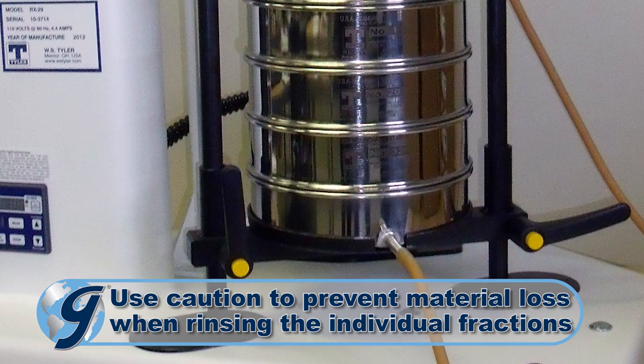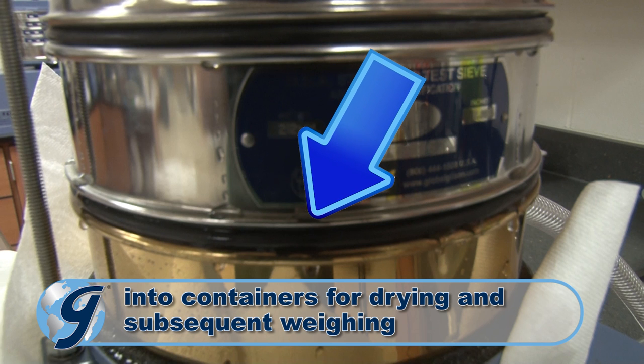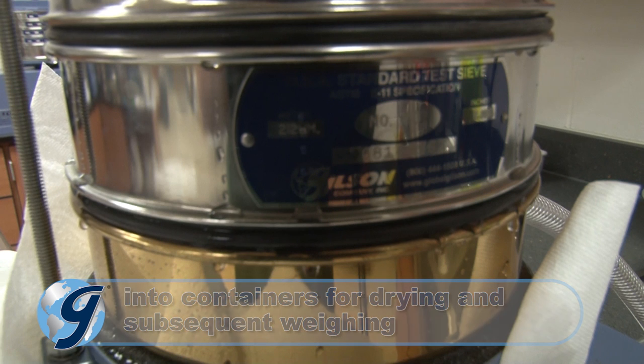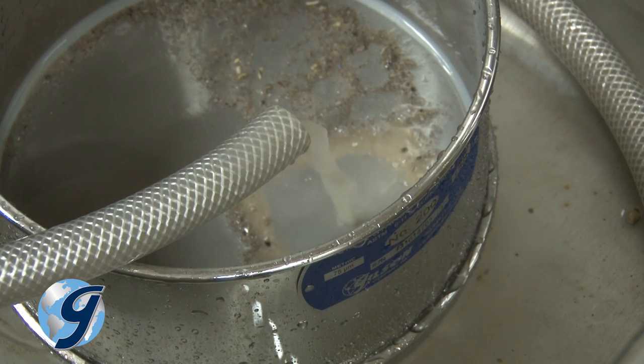Conventional ASTM or ISO test sieves can be used and are often fitted with a sieve seal gasket to control leakage. Procedures are similar to conventional dry sieving, just messier.